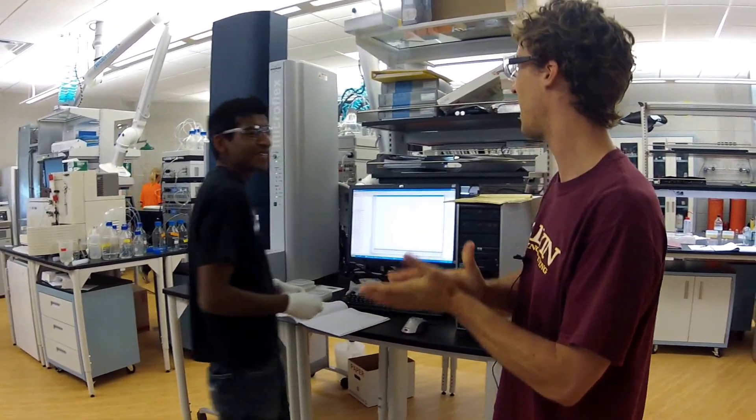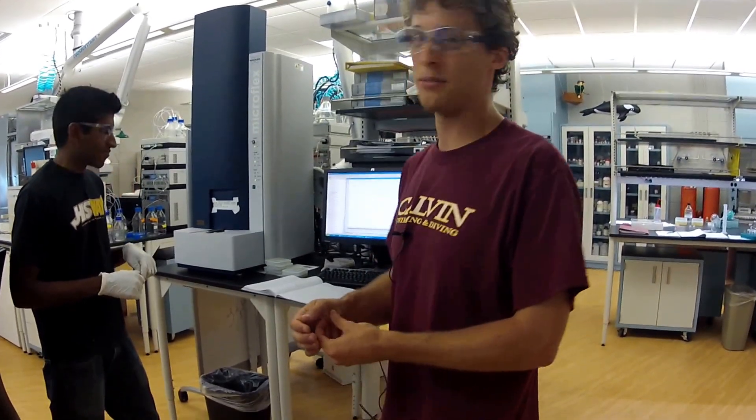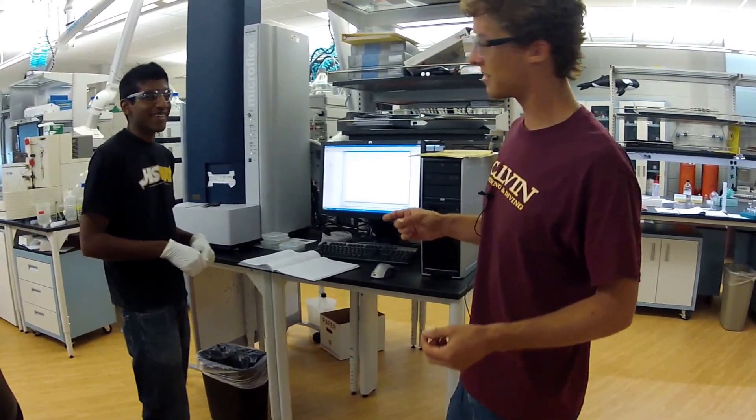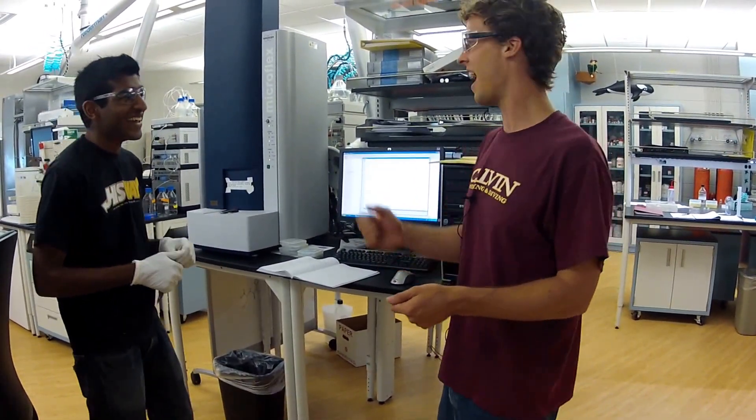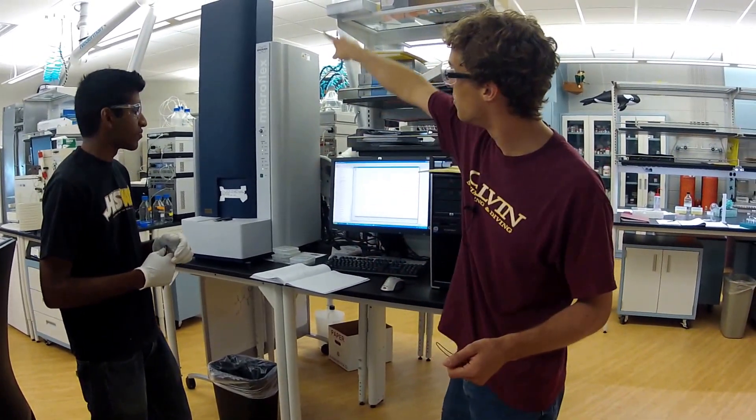So what the MALDI does is basically it's an extremely sensitive scale for things that weigh on the order of 10 to the minus 26 kilograms—so really, really tiny stuff. Basically we put stuff on a plate and zap it with a big UV laser, and then it flies through that tube there. Light things fly faster than heavy things, so then we can tell how much they weigh.